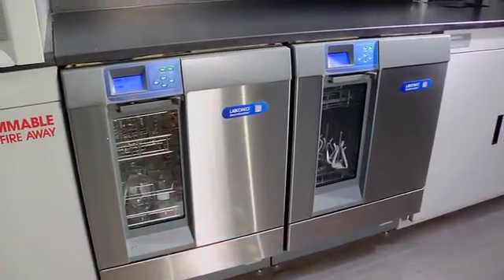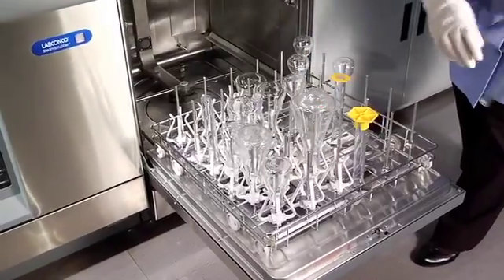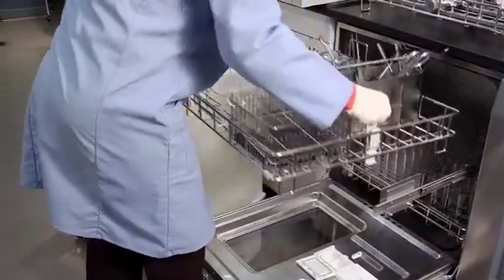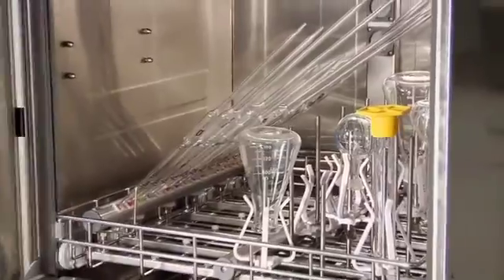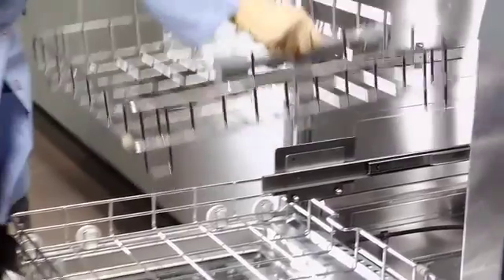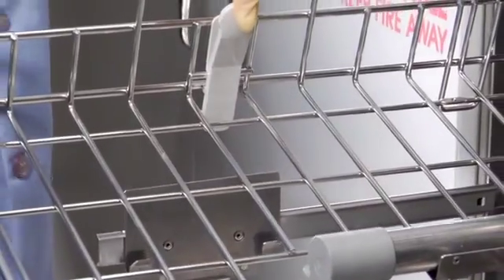The Steam Scrubber, Flask Scrubber, and Flask Scrubber Vantage series come equipped with different rack configurations. The Steam Scrubber comes with standard upper and lower racks. The upper rack may be easily removed to facilitate loading outside the washer or to allow very tall glassware to be loaded on the lower rack. To remove the upper rack, slide it all the way out of the washer, then grasp each side of the rack placing thumbs on the two release buttons.